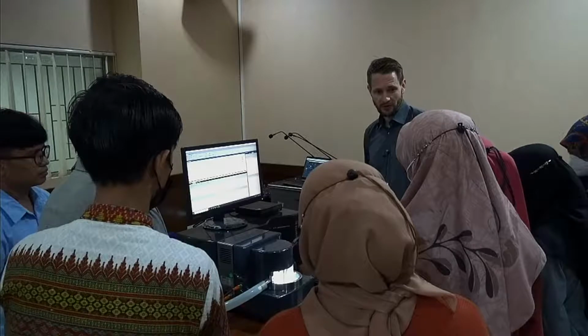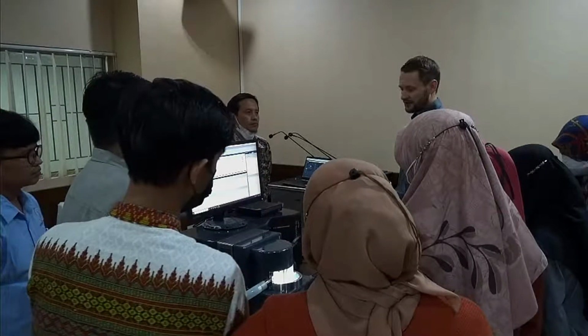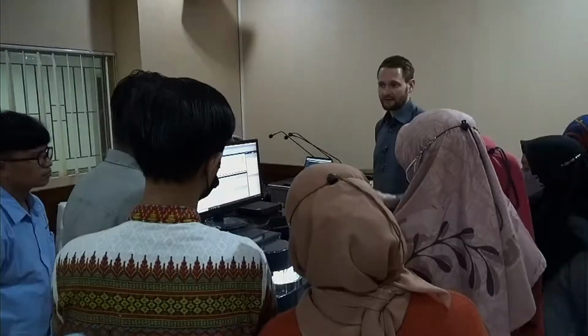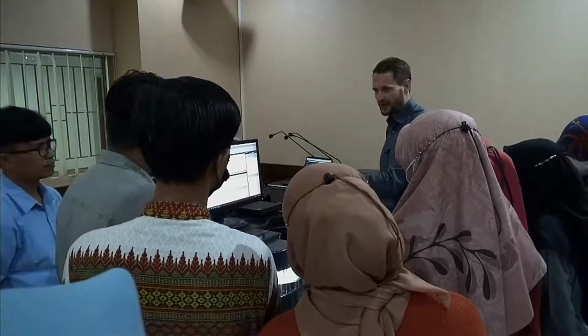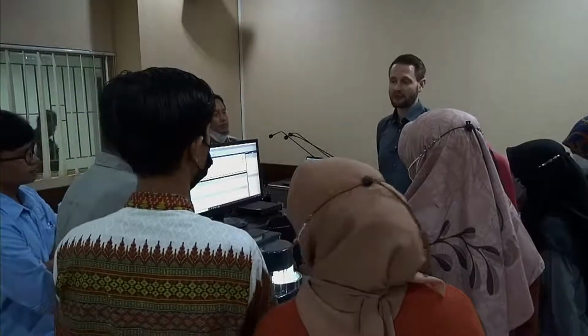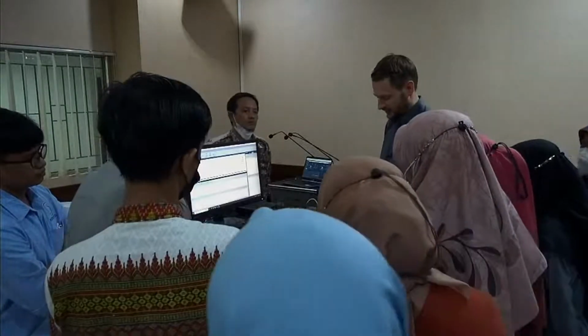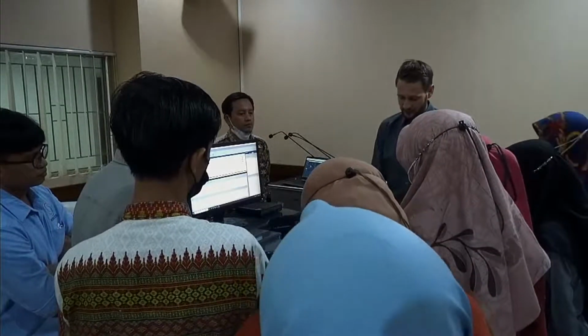So it can happen that air bubbles are sucked into the instrument, and as I mentioned in the very beginning, the instrument doesn't lie. It will tell you what it sees. If an air bubble goes through the cell, the air bubble diffracts light just as a particle would. So it will also show you the size of the air bubbles. Pretty sure you're not interested in the size of air bubbles. But that is something, and I added a lot, so it might be we encounter this problem.